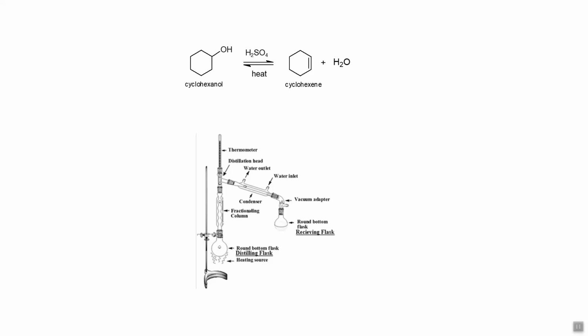Now, just be careful, because if for some reason somebody accidentally got some sulfuric acid in here, you can get a lot of bubbling. So you want to vent your separatory funnel often. And if you see a lot of bubbles when you add your sodium bicarbonate, you do not want to close it until you've managed those bubbles, because you can have a pressure problem. The carbon dioxide can build up, just like in the acid-base extraction labs.